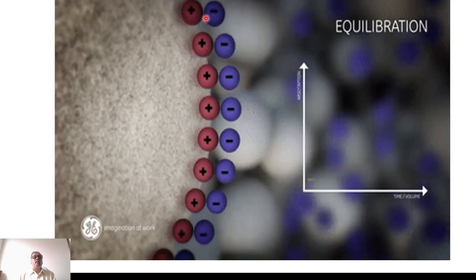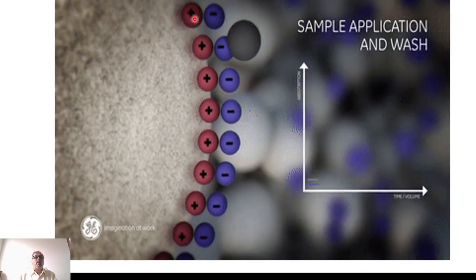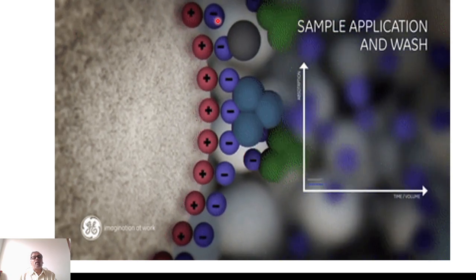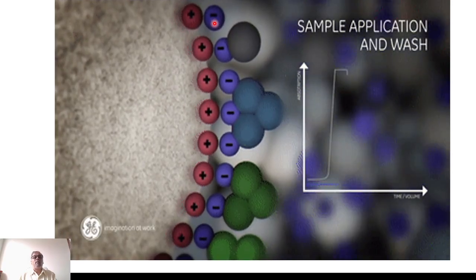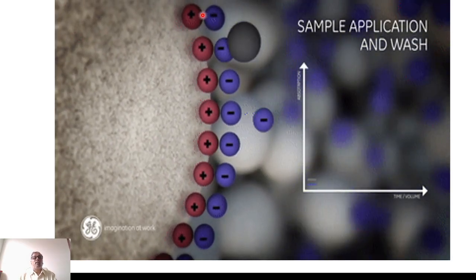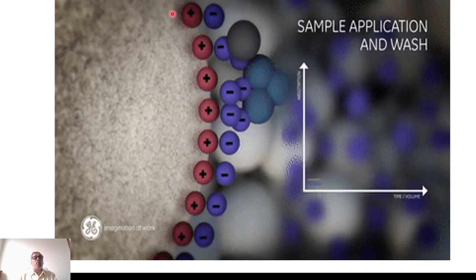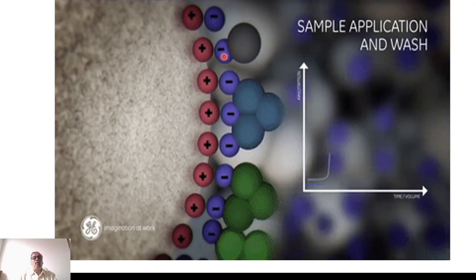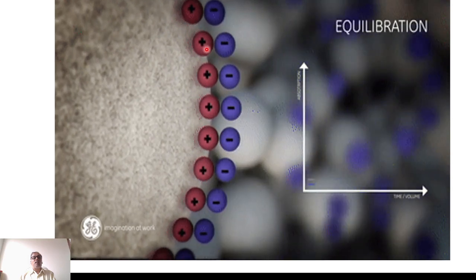It's nothing but ionic interaction. They are interacting through electrostatic mode with the functional group of your resin. So these blue color balls are termed counter ions or diffusible ions or mobile ions. All three names are synonyms: counter ion, diffusible ion, or mobile ion. This plus is fixed, it is immobile, they are not moving, they are part of the structure of the resin. Whereas these small negative balls, the counter ions, interact very weakly with the resin.